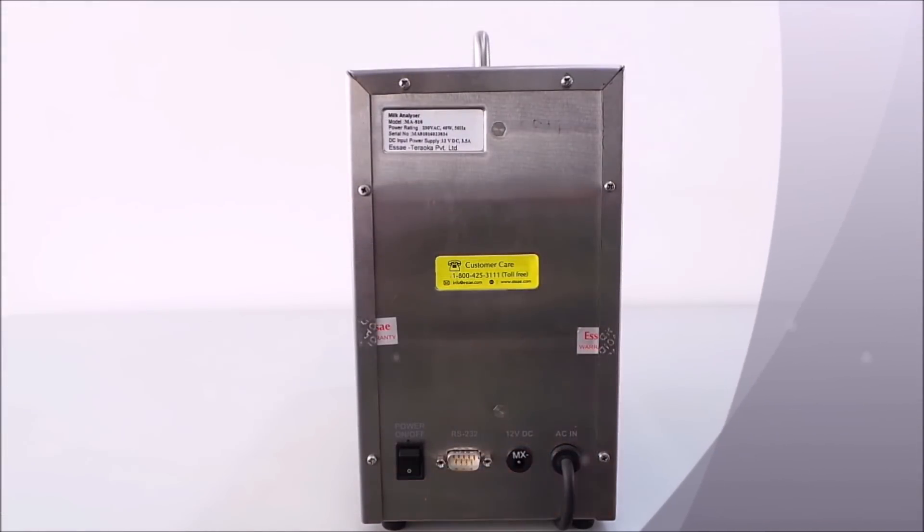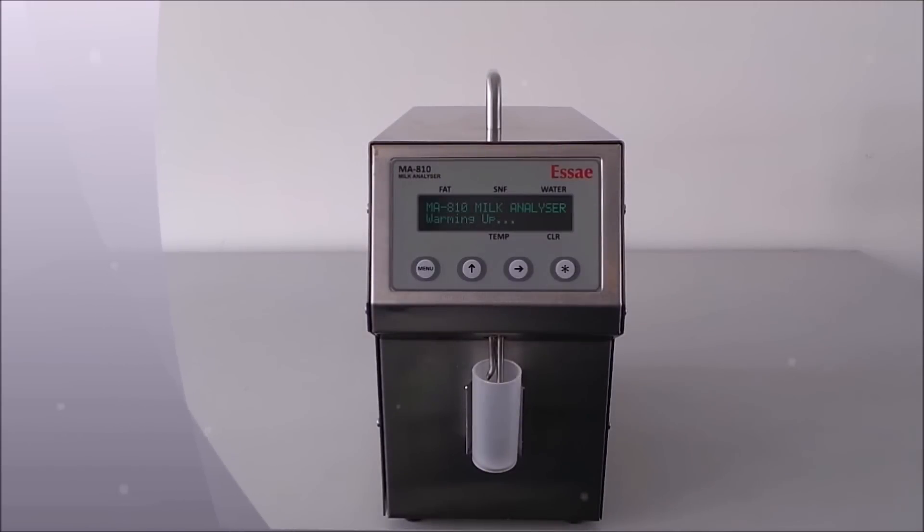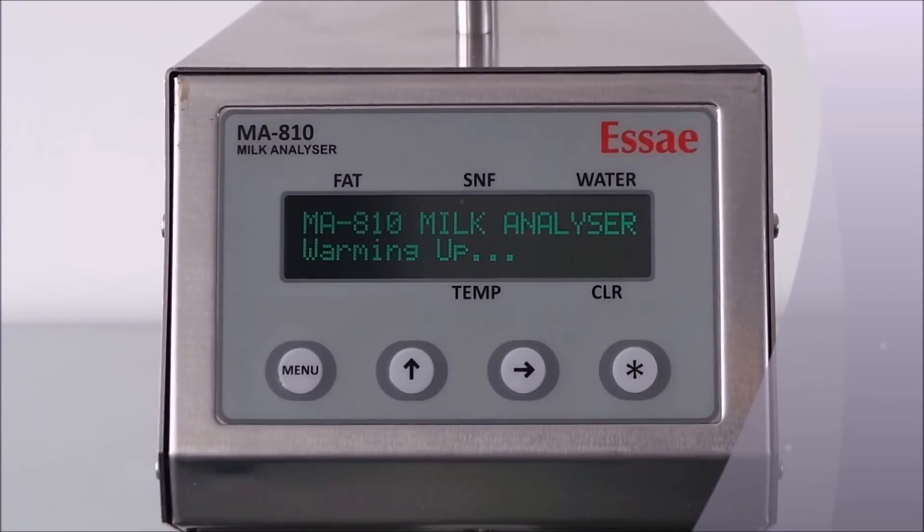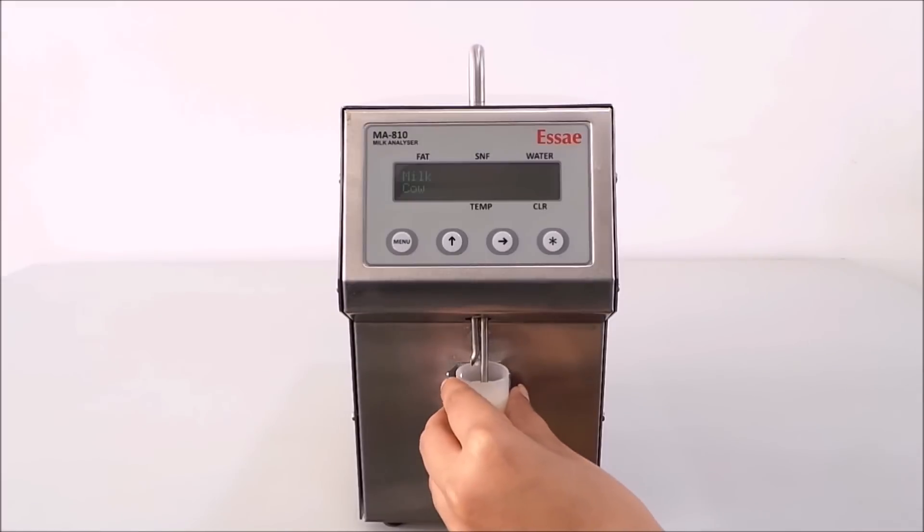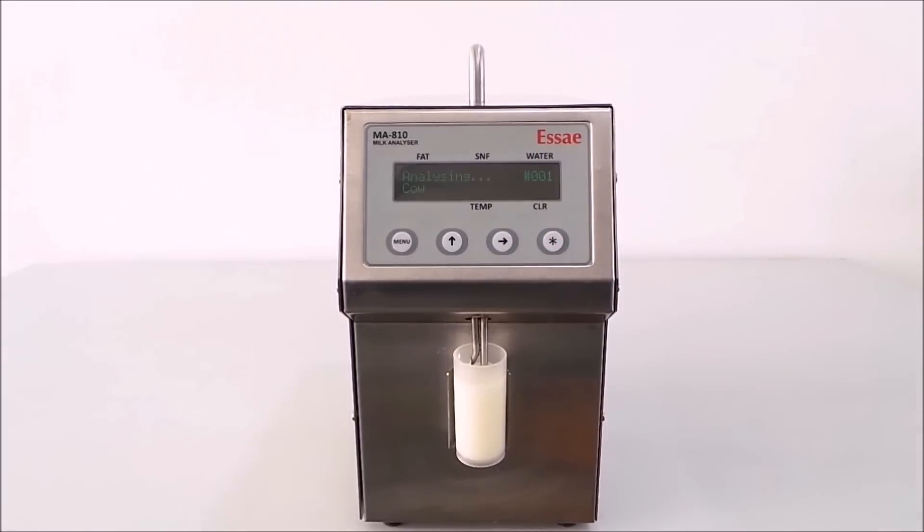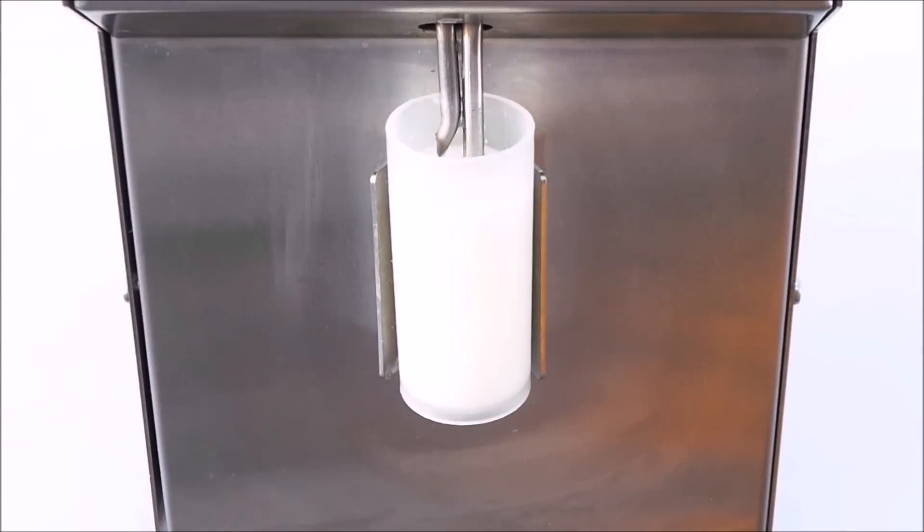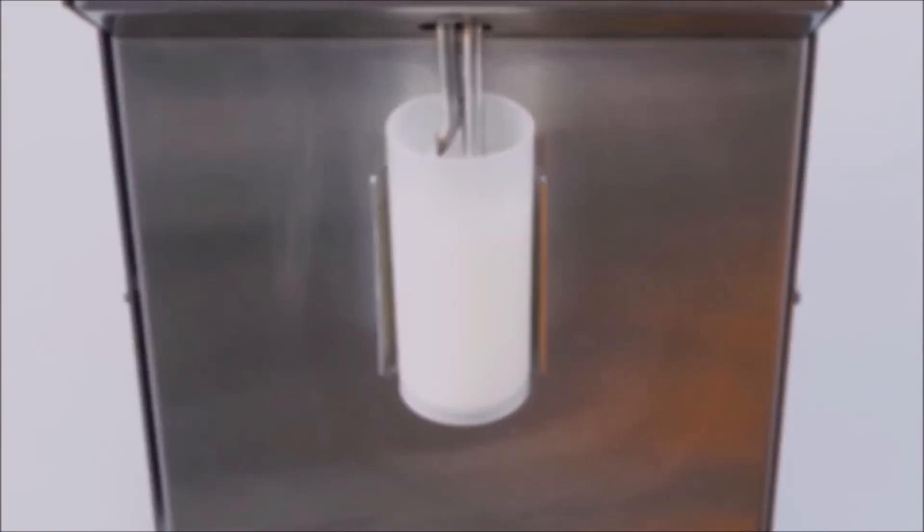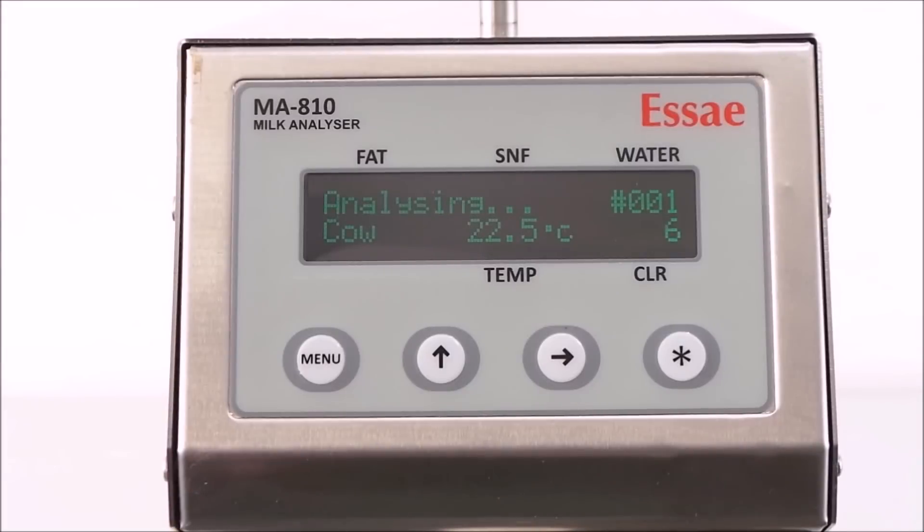To start, turn on the power switch placed on the rear end. Wait for some time to let the machine warm up. Once it is ready for analysis, place the container filled with milk in the holder and press the start button. The machine will take the milk in from the inlet pipe and start the process of analyzing. The countdown will be displayed on the screen.